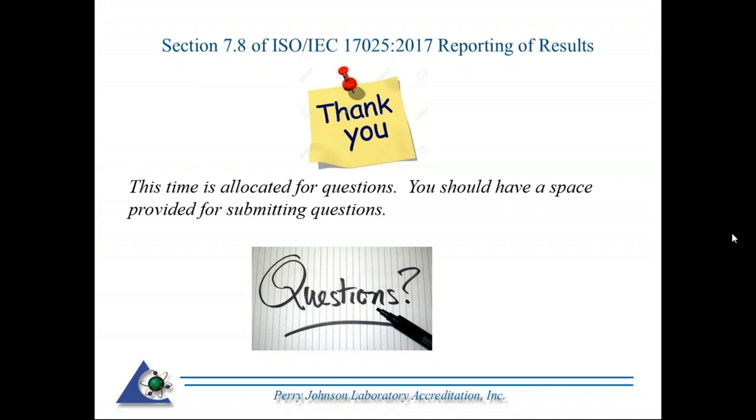About the correction factor, can we calculate it? If it's changing, I'm assuming that you probably could. Perhaps you have a good standard, an artifact that you have confidence in that you can compare it to, and perhaps come up with your own correction factor. If it needs to be traceable, that can open up another ball of wax. So it just depends on how it's being done and if traceability is being maintained.